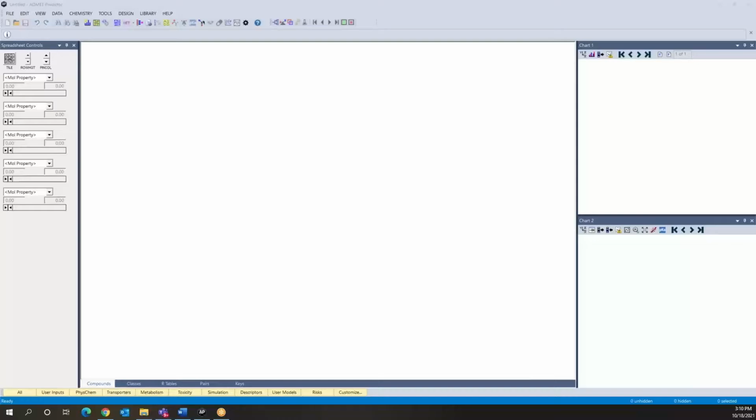Thank you for joining me in this ADMET Predictor interactive tutorial dedicated to substructure and Markush searching. For reference and consistency with other tutorials, I'm using version 10.2 of ADMET Predictor, which is also known as APX.2.